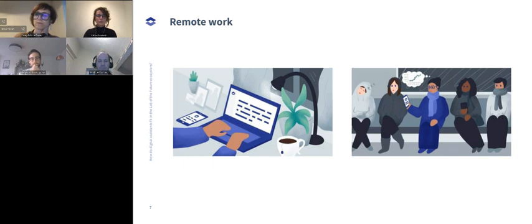So, for example, you have the actual R&D scientists who need to look at data in a particular way. On the flip side, you have the lab managers or maybe facilities managers who don't need access to certain individual data sets, the analytical data. They need something that's more what we call summary statistics. They need utilization data, aggregated data. And so being able to construct those consolidated data sets and consolidated insights as opposed to the raw data, you're really looking at two different use cases.